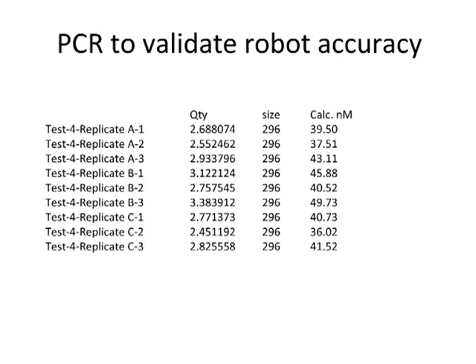The other thing that we find real-time PCR is very helpful for is, once you have a known library amount and quantitation, we actually use the KAPA real-time PCR results to validate the robotic accuracy. In this case, we're testing different replicates using different channels on the Beckman deck, essentially as a pipetting step, and we can use this as an assay to determine what type of variability we have. Or if we're developing a new pipetting template, we'll use this PCR methodology to validate the robot accuracy, as you can see here. In this case, this would indicate that one of the channels that's at 36 as well as the other at 49 needs some adjustment.